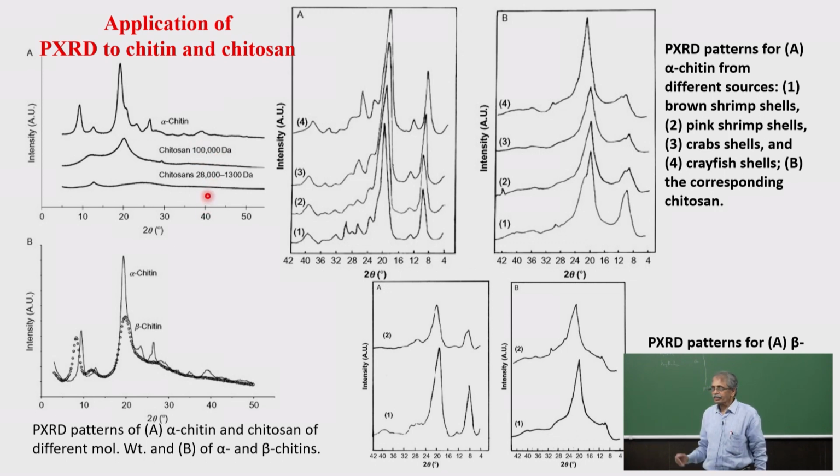No, so they are different. So we cannot just attribute it to the molecular weight, though you can say the variation in the molecular weight has given this. Indeed, it is the variation of the molecular weight which is reflected in the particle size, particle shape, etc. Particle size distribution, particle shape distribution, all these are important. So that makes that sharper.